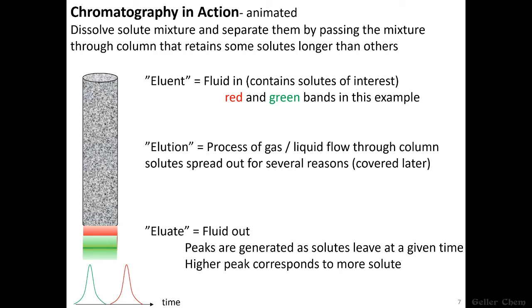And so notice these peaks were created at the exact same time that the bands, as we call them, started coming out. And the maximum value of the peak was detected at the same time that the center of the band made it through the column, because this is where the bulk of the chemical solute particles remain, in the center. But we see that some of them just get a little bit ahead, and some of them lag behind. We'll get into why that happens and why it's important in a future video. Just keep it in mind for now.